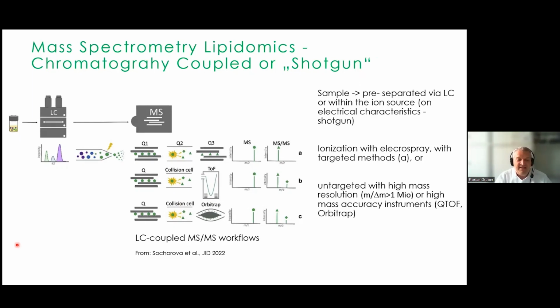If you then add liquid chromatography in front of that, and couple it to the mass spec to separate the sample before the ionization, then you have a very, very powerful tool to address the complexity, and it has been used frequently to investigate the complex composition of the skin lipidome.